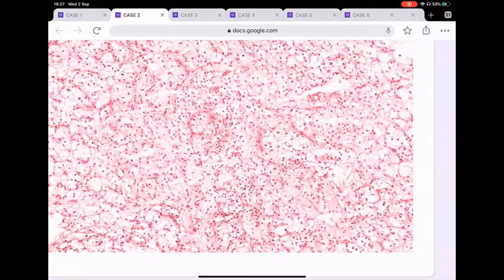Take the adrenal out of your mind. This is not adrenal. This is a completely different scenario from the parathyroid gland. In the parathyroid gland, the surgeon cannot decide what's adrenal, what's parathyroid and what's lymph node. I agree, and this is one of the reasons why they send the parathyroid for frozen section. But believe me, the surgeons know what's kidney and what's adrenal because the adrenal looks yellow.